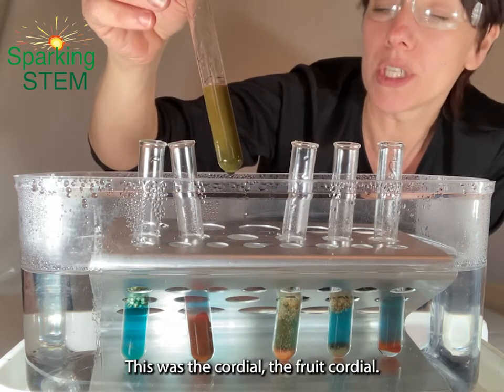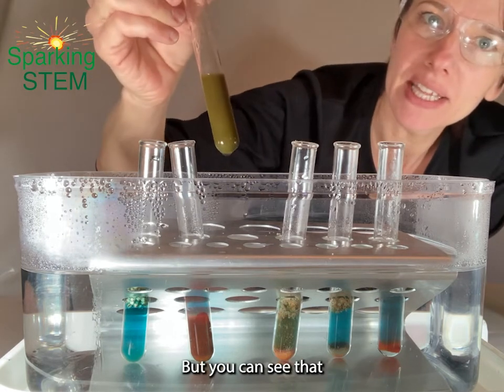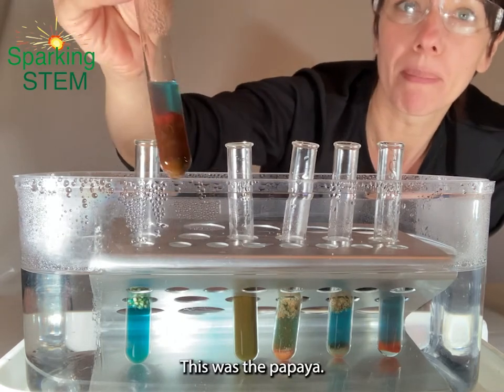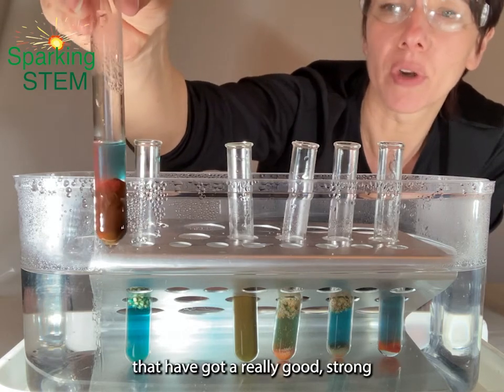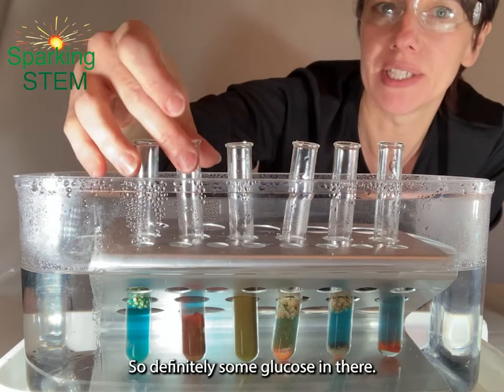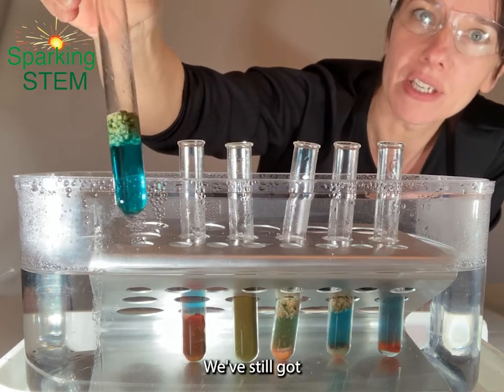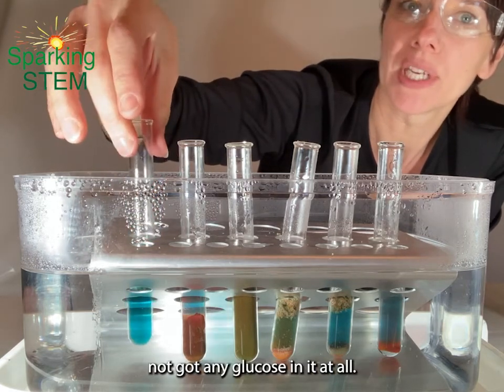This was the cordial, the fruit cordial. It's got a kind of murky blue colour — not so colourful perhaps. But you can see there's a hint of green, a hint of yellow in there, so it's definitely got some glucose present. This one — wow, look at this — this was the papaya, the candied papaya, and you can see we've got some areas that have got a really strong reddish orange precipitate, so definitely some glucose in there. And then this was the quinoa — it's not showing any sign of any of those traffic light colours. We've still got that beautiful blue colour from the Benedict's solution, showing that it really hasn't got any glucose in it at all.